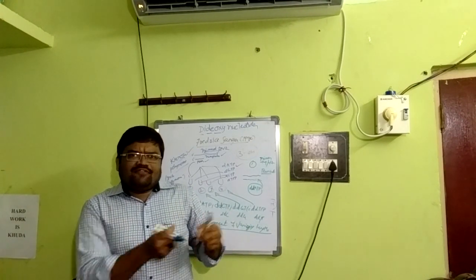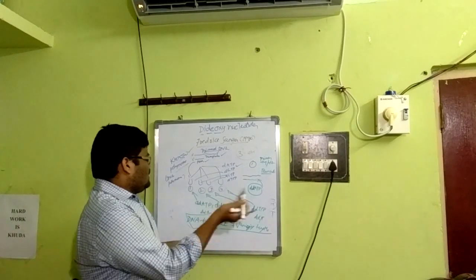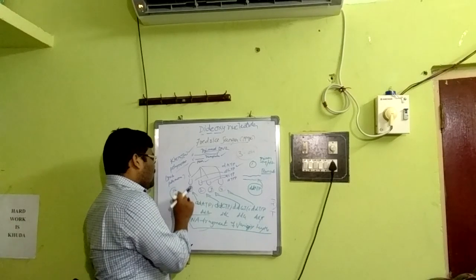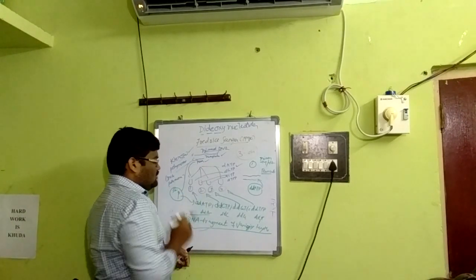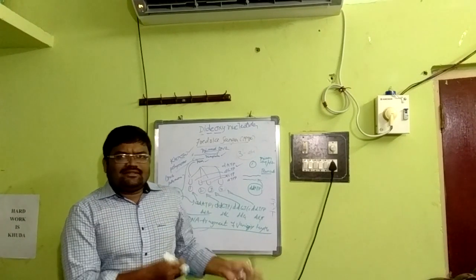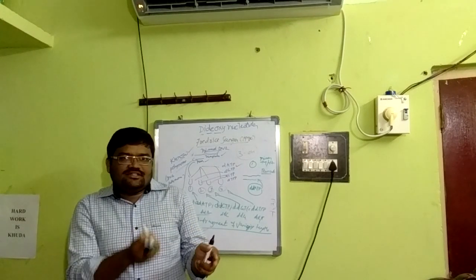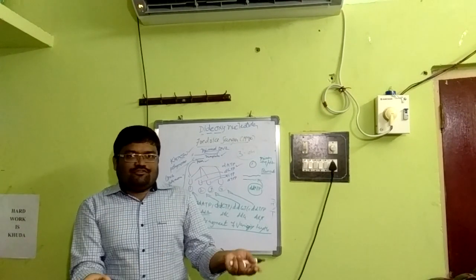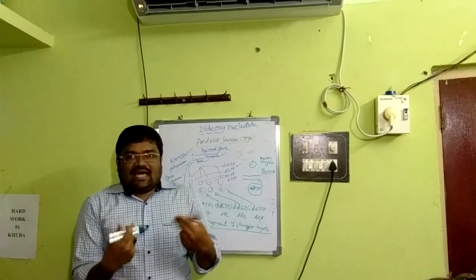After we get the different DNA fragments, the denaturation will be done, and the most important thing here, of course, the usual process, is the P32. P32 we have to label either to the primer or to the dideoxynucleotides. Therefore, after labeling, the process will be done like this. Then after denaturation, the free strands which are radiolabeled we can collect. Then electrophoresis, then autoradiography. But this is not as simple as I have explained.